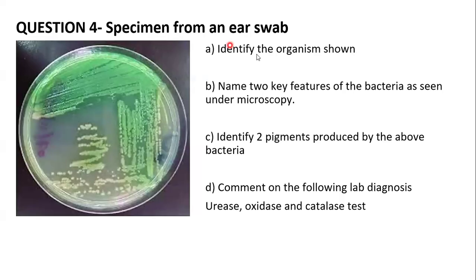So depending on the staining technique you use, because Listeria monocytogenes is highly motile, and on light microscopy, you'll see that tumbling motion, how it moves really, really fast. So it depends on the staining technique. All right. Thank you. So I hope that's clear.